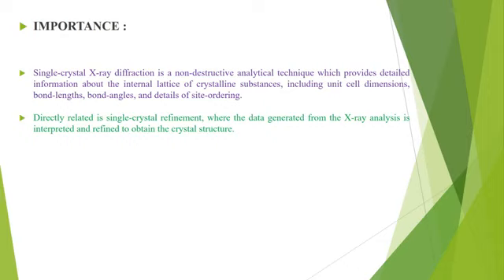Non-destructive technique means the sample we analyze is not destroyed by this technique, and the information includes unit cell dimensions, bond length, bond angle, and details of the site ordering.